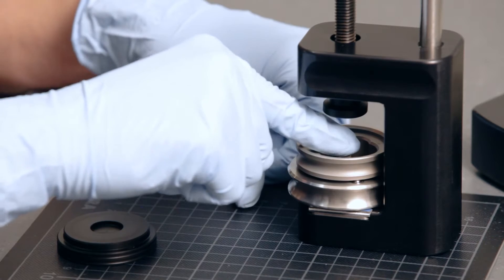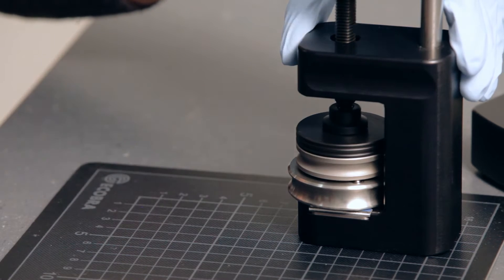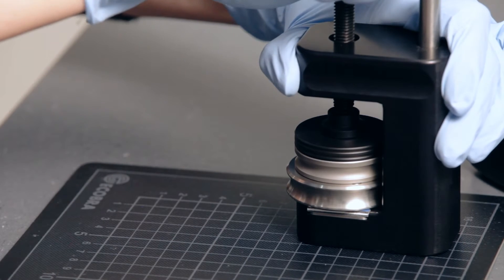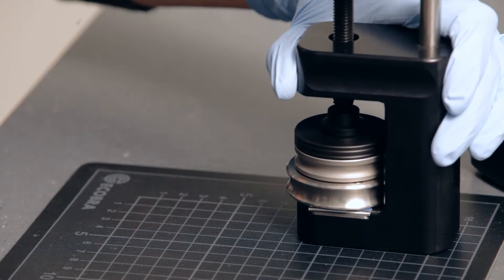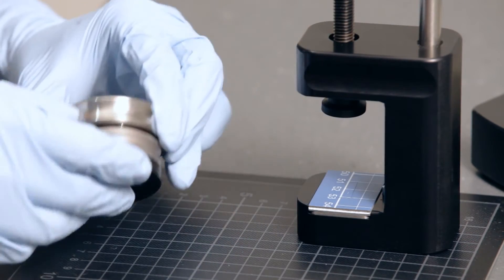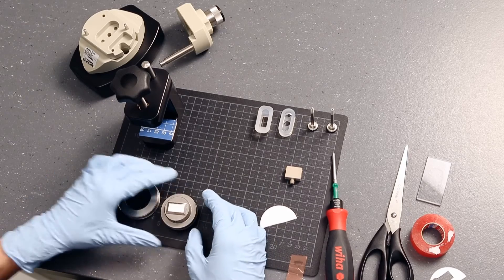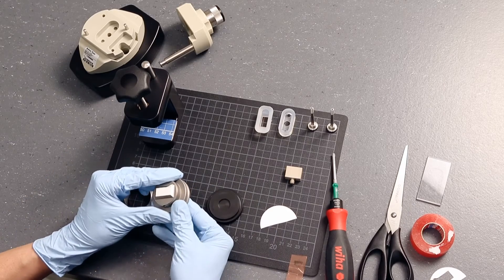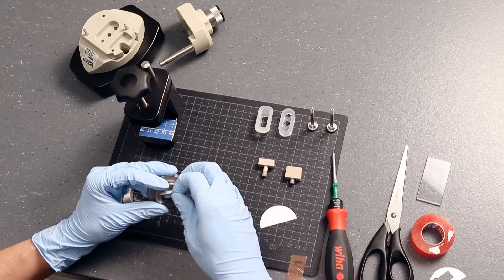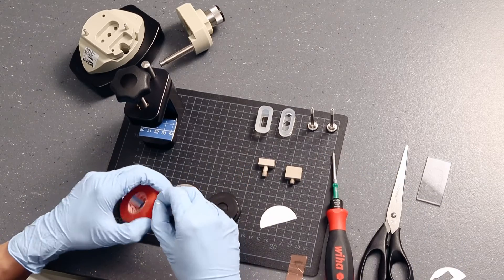Press down the sample holder again. Punch out a membrane sample piece with a size of 20 mm by 10 mm. Place the sample holder onto the puncher. Proceed in the same way with the second sample holder.